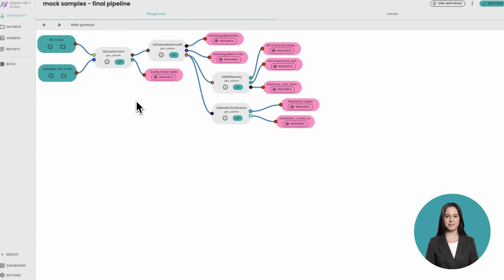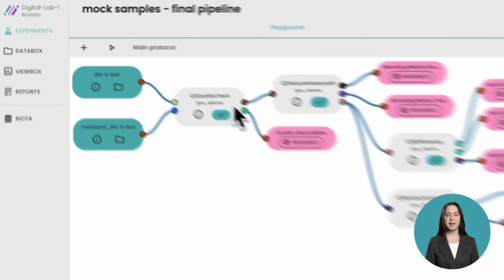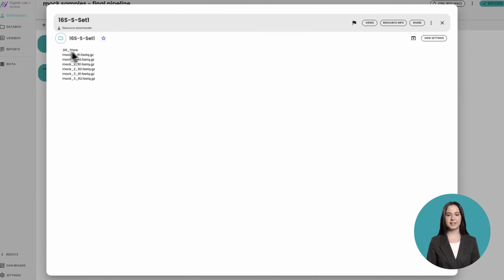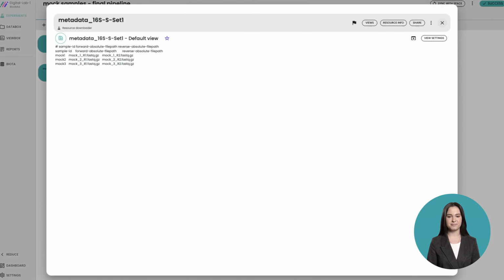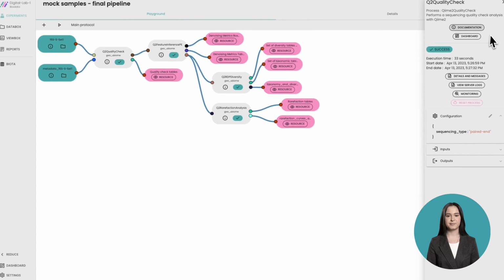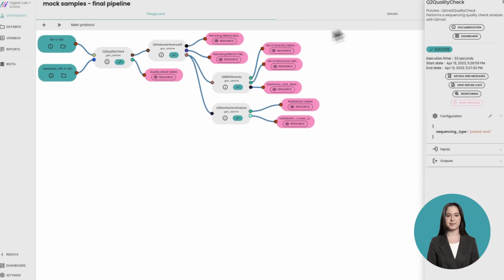accessible from Constellab Community. For example, this pipeline represents a collection of tasks accessible from the uBiome brick designed to process metabarcoding sequencing data. It receives two types of resources as input with green boxes: a folder containing paired-end sequencing files and a metadata file.